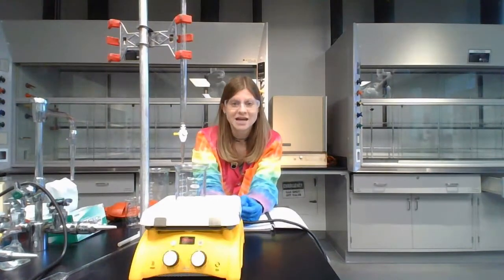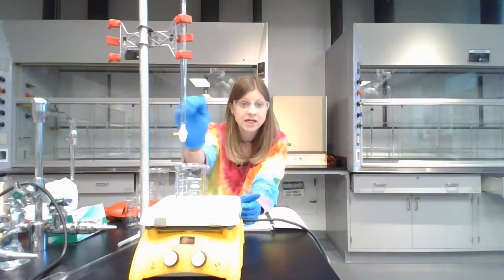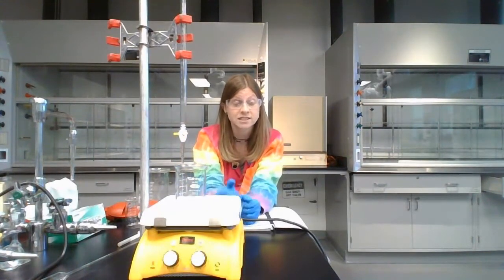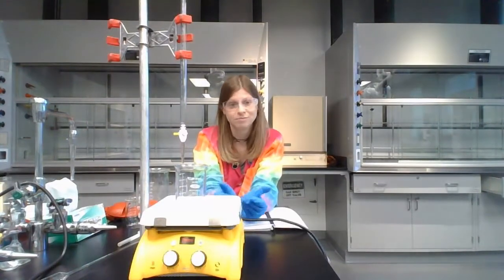We need the color to stay for 15 seconds before you are at the end point. So if the color changes, but then it disappears in less than 15 seconds, you're not done. Add another very small increment. And then you have to keep doing that until the color stays for at least 15 seconds. With the acid-base one, it was 30 seconds. It's 15 seconds for this lab because we're at a higher temperature. These reactions happen faster, so less time.